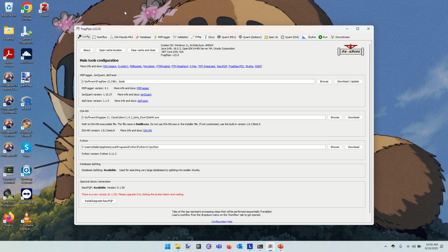Now, if you've been in proteomics a long time, that probably makes perfect sense right from the word go. But I don't know how broad your proteomics experience has been in the past. So who has looked at data from a proteomics experiment or had some training in class? Okay. Proteomics doesn't always make friends right away, so I understand.